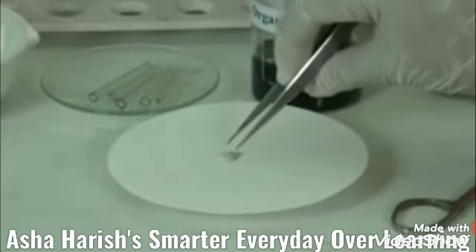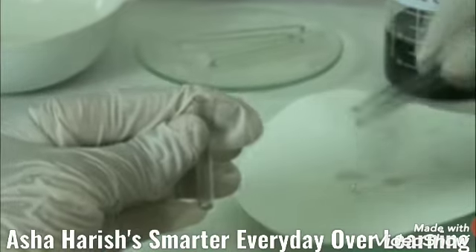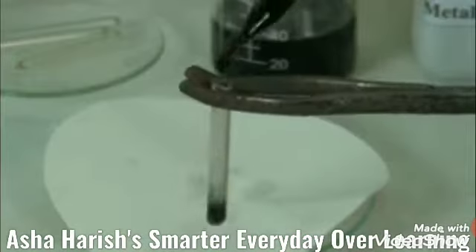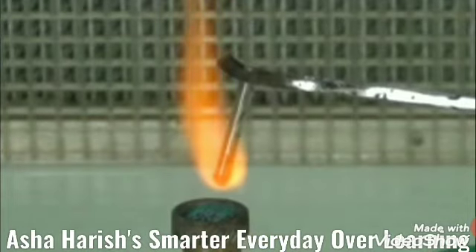First of all, you have to take with the help of forceps a small pinch of freshly cut sodium metal, about the size of a pea. It is heated gently in a fusion tube, which you take with the help of forceps. And this is the tongs. With the help of tongs, you need to place that fusion tube on the Bunsen burner. Then it is gently heated. Then nearly 50 to 60 milligrams of organic compound is added to that fusion tube and heated strongly till it becomes red hot, just 2 to 3 minutes.